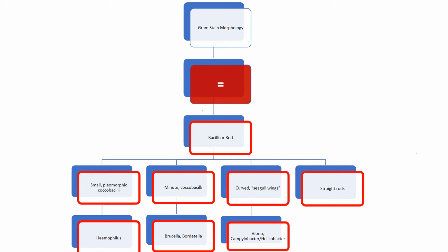Obviously, you will still have to culture your sample in the appropriate media, recover the organism, and perform the appropriate biochemical tests to completely identify your isolate. So what I'm saying is that by looking at the microscopic morphology, associating where it came from, that is a clinical sample, you begin to connect the dots. Or that would help you connect the dots. Is that making sense? So these are just some examples, and does not include all. I suggest that you complete the rest of this chart.